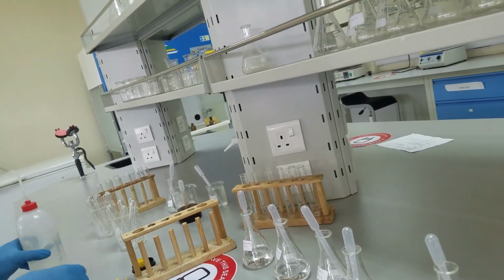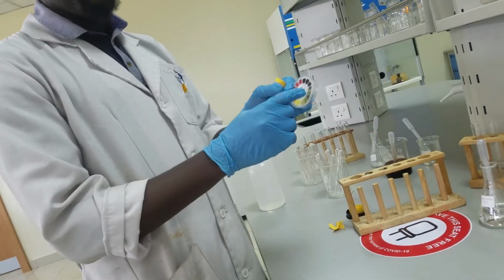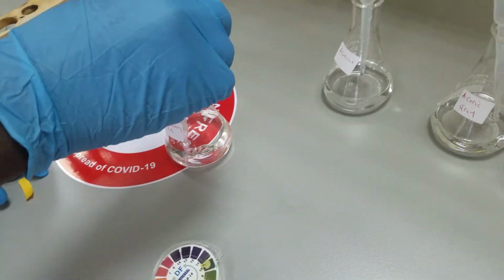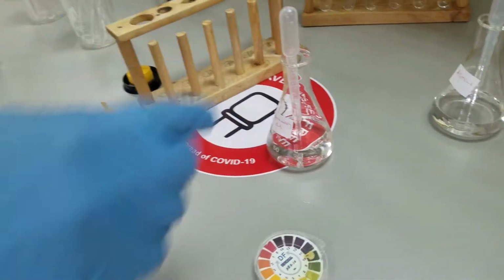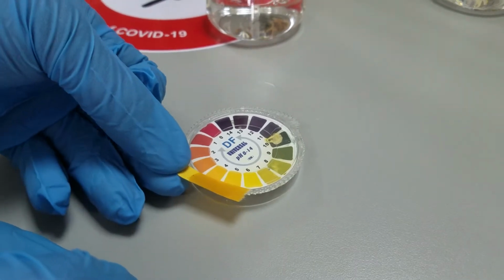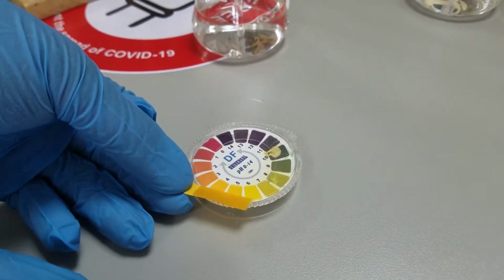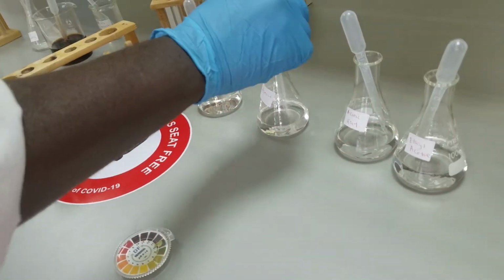Now I'm going to do acidity of the knowns. We have our pH paper and the wheel that has the color change from pH 0 to 14. So I'll need you to observe the color changes. Look at this, that is formaldehyde. Look where it falls and record. Okay. Our second one is acetone.